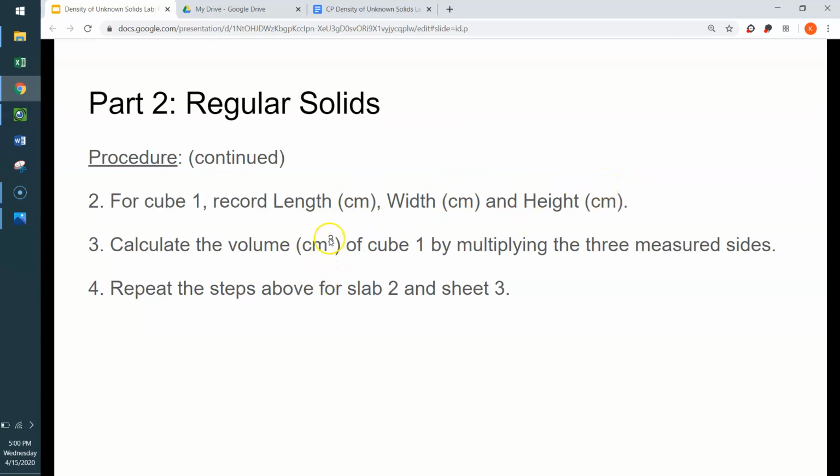Now a common misconception is people think that this cube value would mean that you multiplied any number before it 3 times, but you don't. The cube is solely referring to how many centimeters you multiplied together.